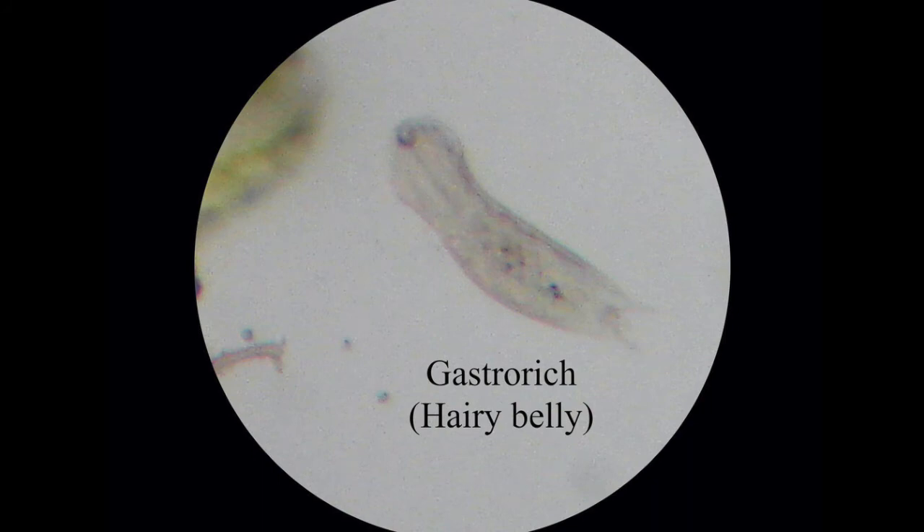This is called a gastrotrich, or hairy belly — great name. If you look at the front of it you can see a little mouth at the top there, and then they have these two tails at the bottom. These things move around fairly fast, so it's quite hard to keep track of them and try to get a photo under the microscope.